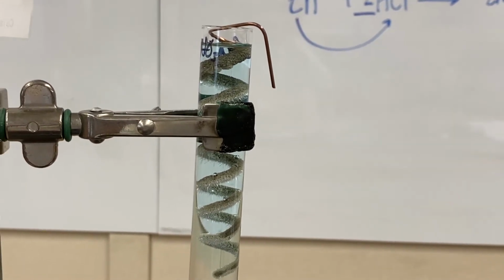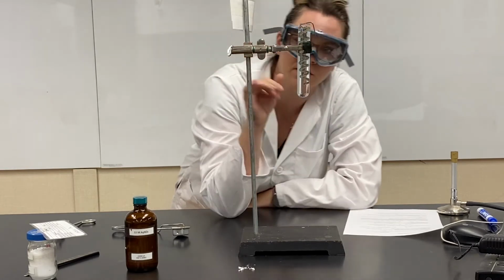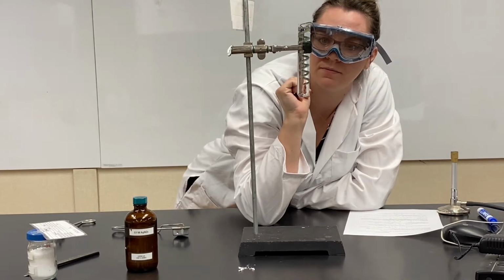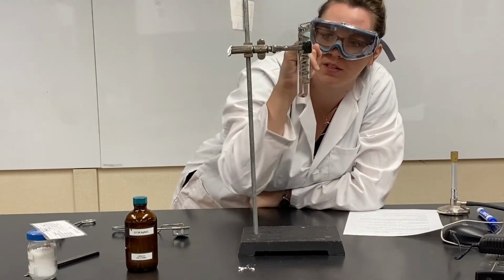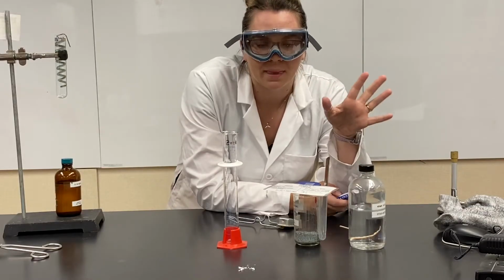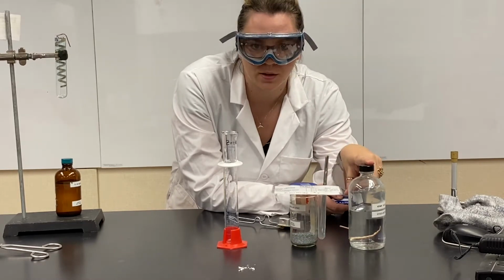Gotta love it. So I'm going to move this off to the side so we can keep going with our demos. But you can really start to see the crystals now. I'm going to zoom in again in like 20 minutes or so so you can really see what's going on and what it looks like. Okay, our next demo is we have zinc metal, and we're adding it with hydrochloric acid.